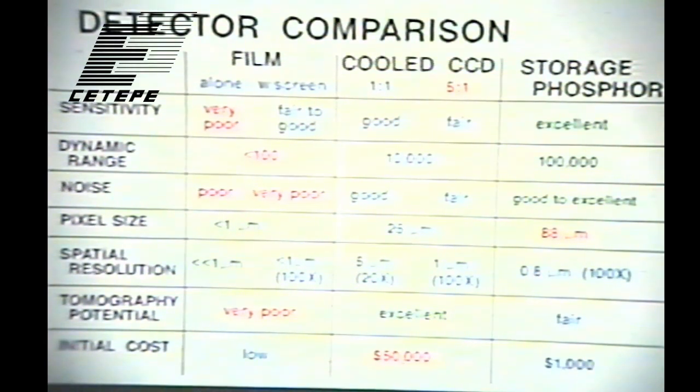And then it gets reduced by the image intensifier to a 1 inch output, and then that gets focused onto the 1 inch CCD. But if we used our 1 inch CCD and got rid of the image intensifier, which is something that I'd like to do, then 5 inches would become a very big screen, because if you want to reduce a 5 inch image to a 1 inch CCD, that's exceedingly inefficient, as I have a slide coming up. It's less than 1% efficient. So you'd lose 99% of your light coming off the phosphor onto your CCD.